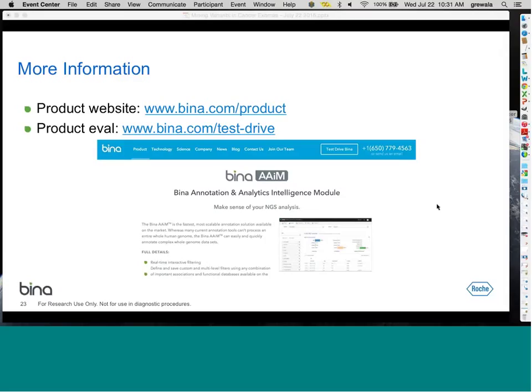There's a question about gene annotation, where the gene annotations come from. The definition of the gene itself comes from RefSeq. We also have Ensembl gene annotations available in the software. In terms of annotation, a number of the databases also provide information about genes, the disease databases, the cancer databases. So there are annotations about genes available from those databases as well.